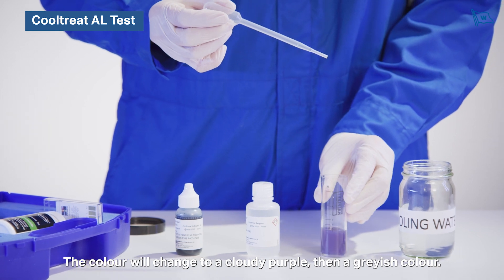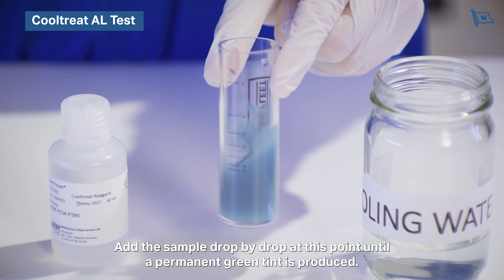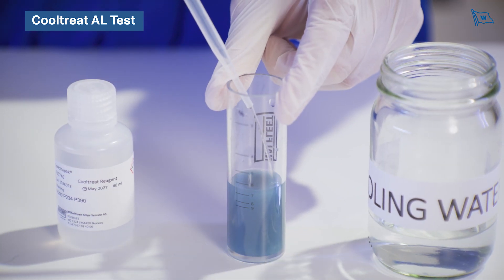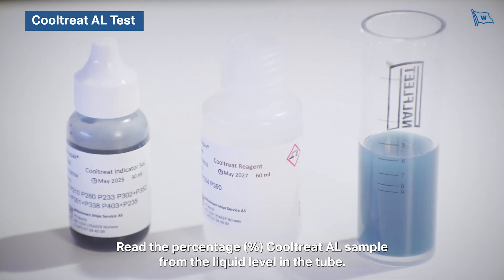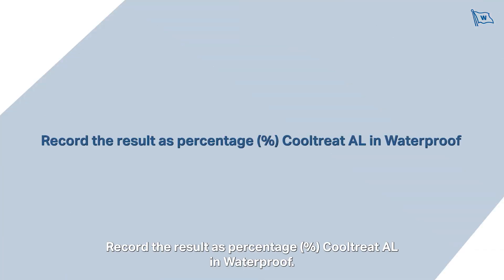The colour will change to a cloudy purple, then a greyish colour. Add the sample drop by drop at this point until a permanent green tint is produced. Read the percentage Cooltreat AL from the liquid level in the tube and record the result as percentage Cooltreat AL in waterproof.